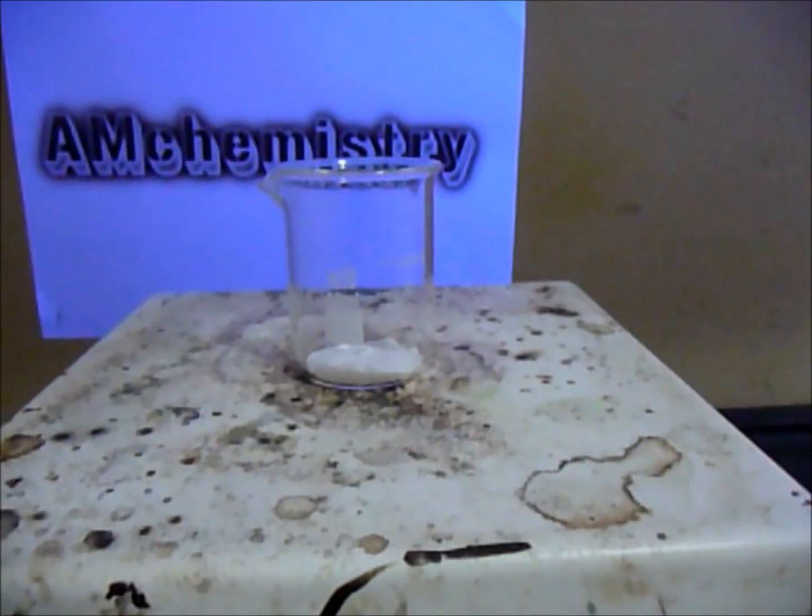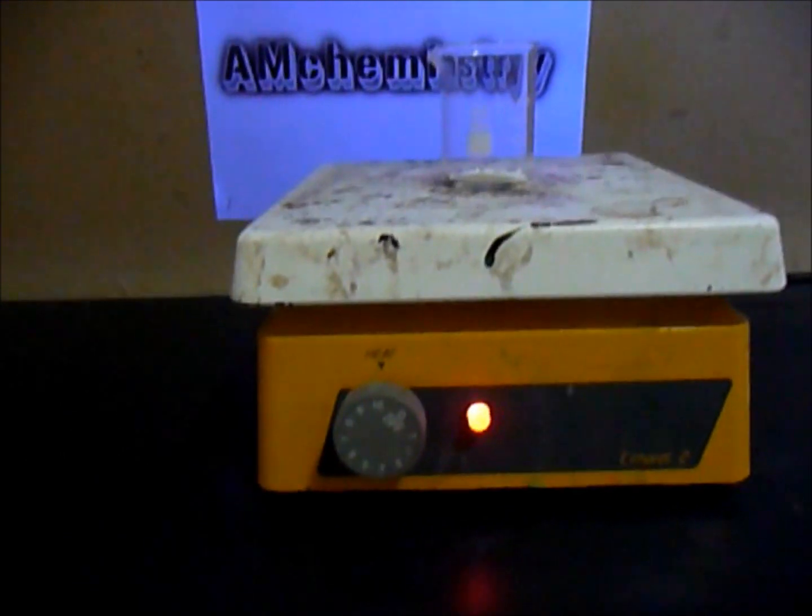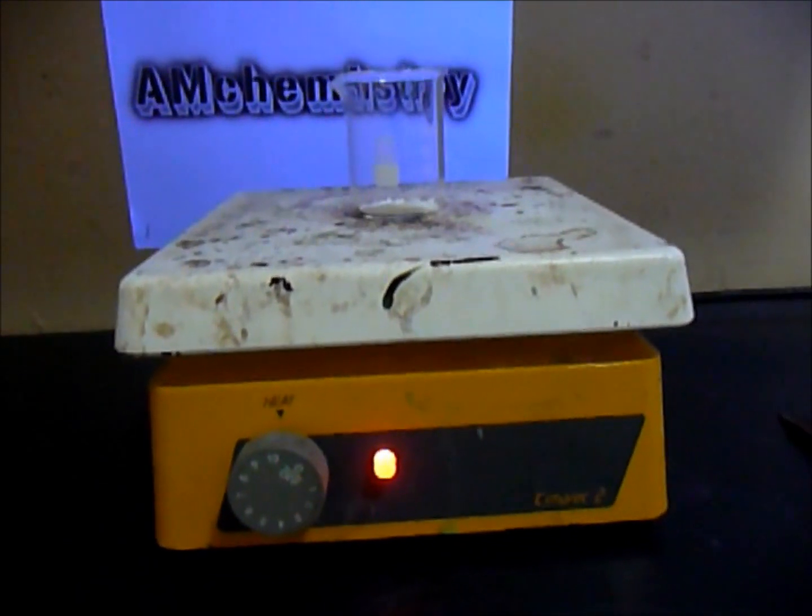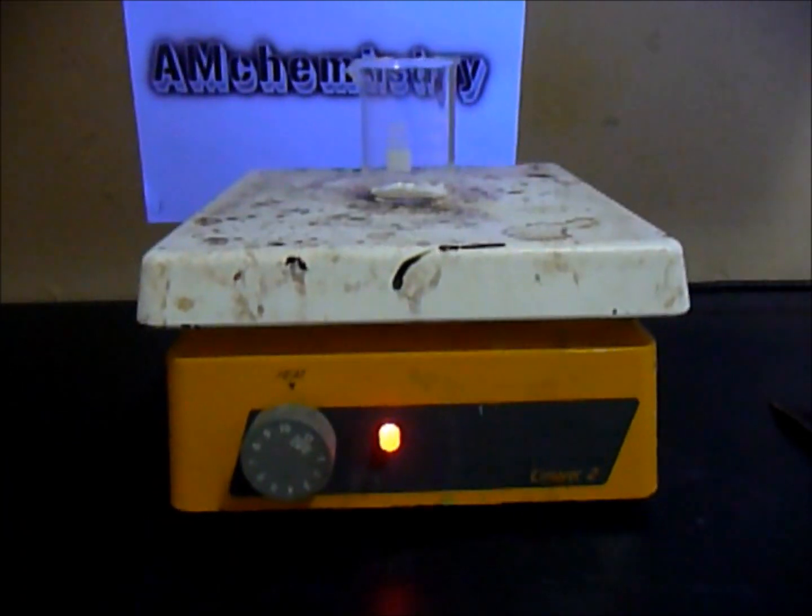While I'm heating this, I'll show you when it's fully converted. And I'll show you while the reaction is going. Well, not reaction, it's actually a decomposition. So I'll show you while the decomposition is happening.